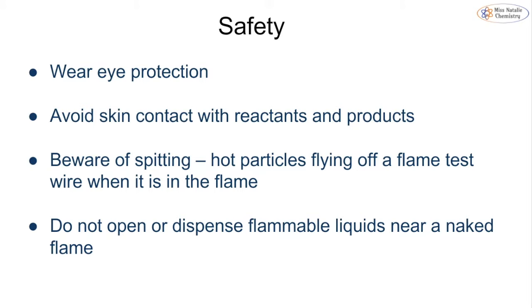In terms of safety, of course, wearing eye protection and avoiding skin contact with our reactants or products. If we have a flame test, we just need to be aware of any spitting or hot particles flying off of the wire. And of course, we don't want to have any flammable liquids near our naked flame.